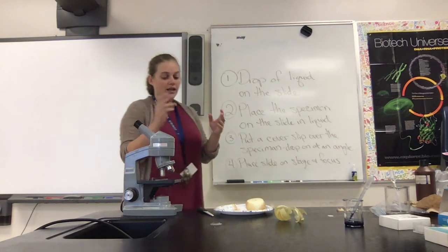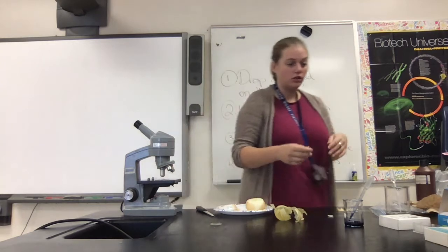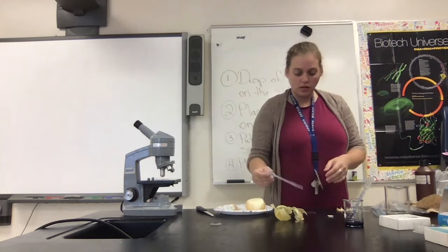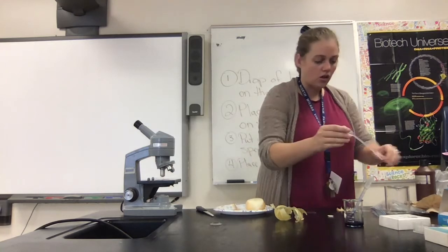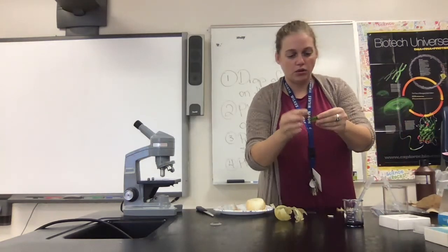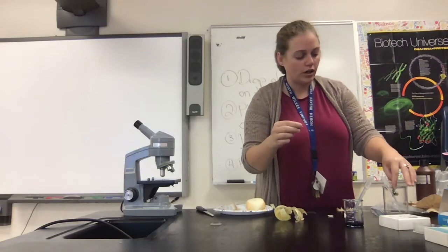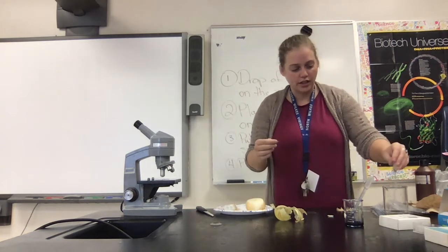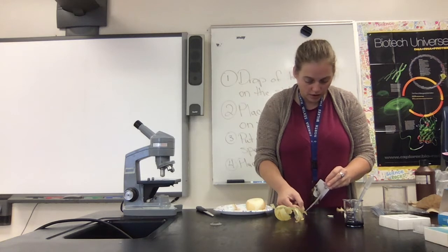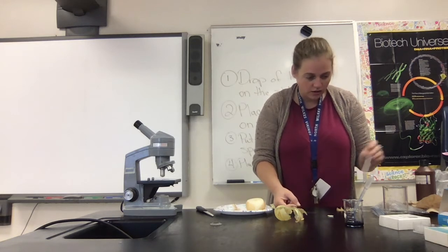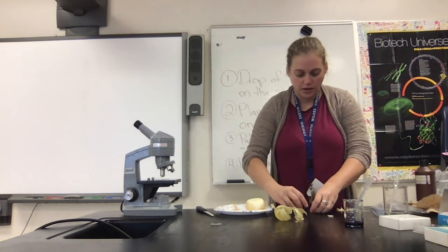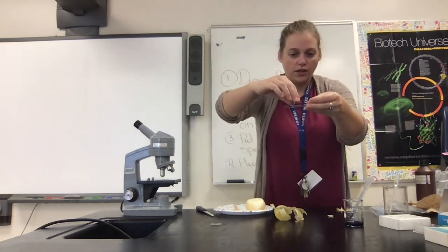So you saw me make an onion slide — that's the first kind of cell we're going to look at. We're also going to be looking at a green plant. I'm going to make a wet mount slide by dropping a single drop of liquid on the slide. We are using Elodea because it's only two cell layers thick, making it really easy to get a good picture on the microscope. So we put the Elodea leaf in the slide and place a cover slip over it at an angle to squeeze out all of the air bubbles.